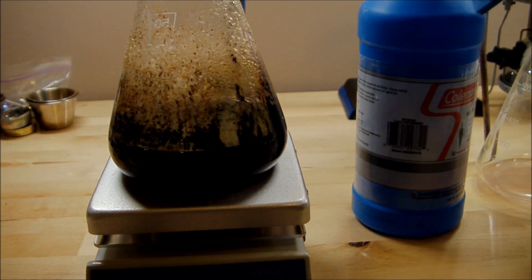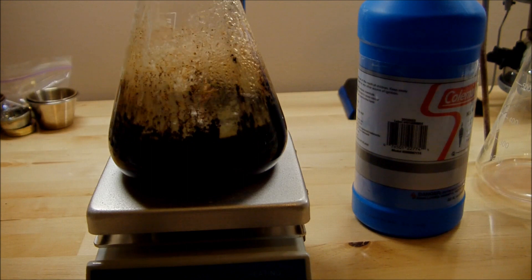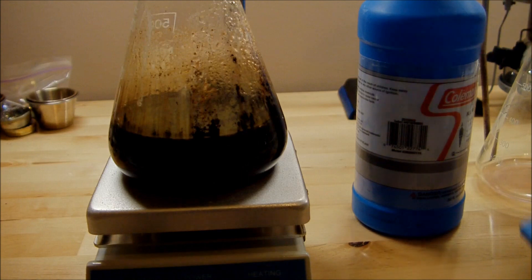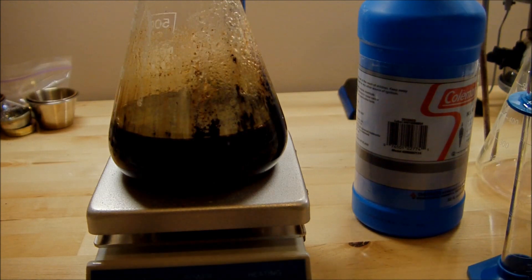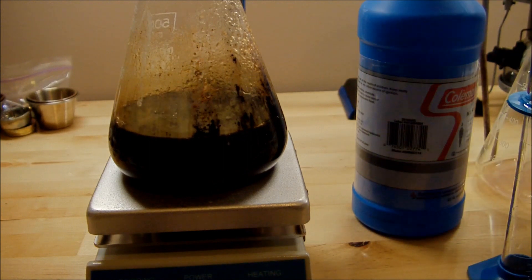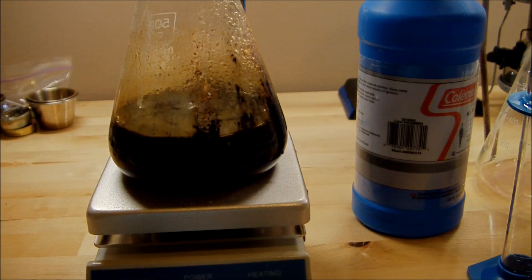I'll add the rest of the kerosene. This part you should also be doing outside because kerosene puts off a lot of fumes. To mix everything together, I'll just throw my stir bar in there and let it stir.